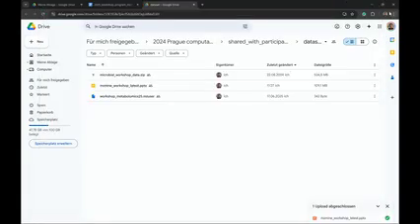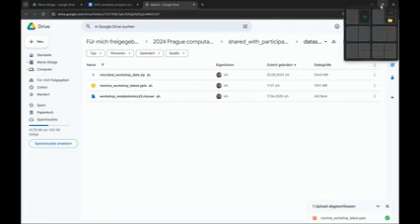And with this, I would like to start the hands-on session, so you can all boot up your laptops and already start mzmine.